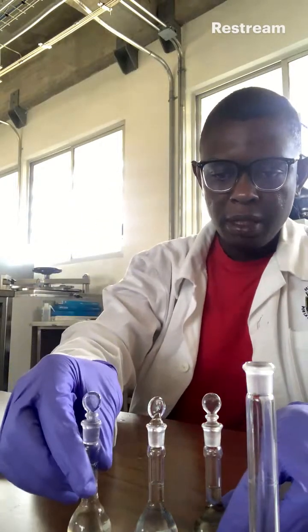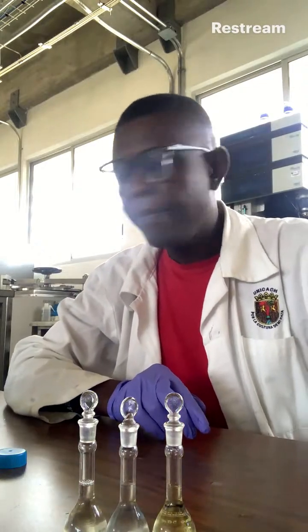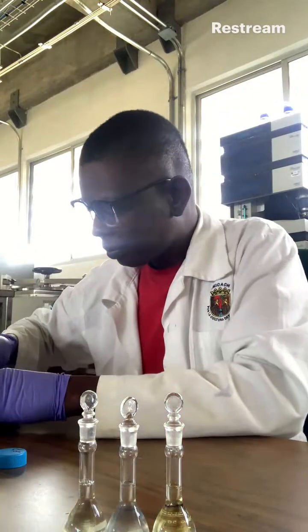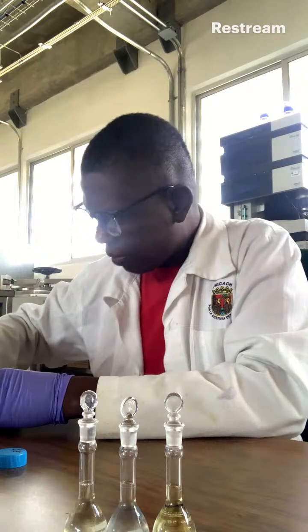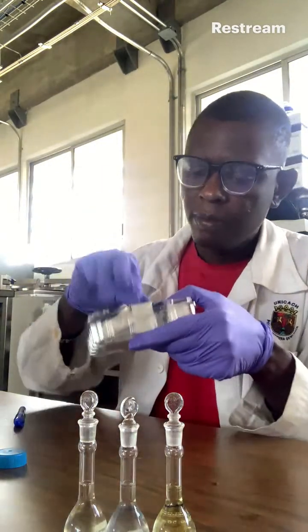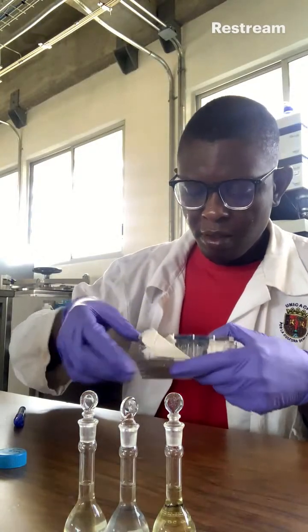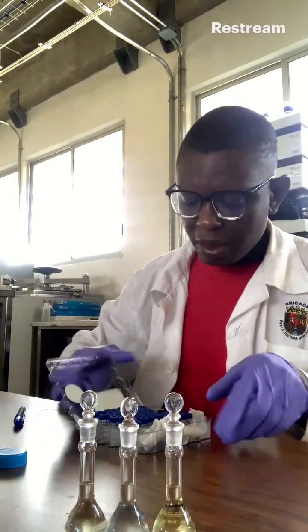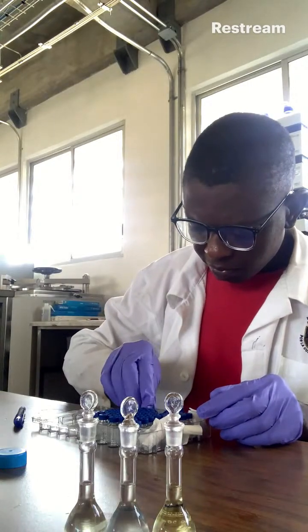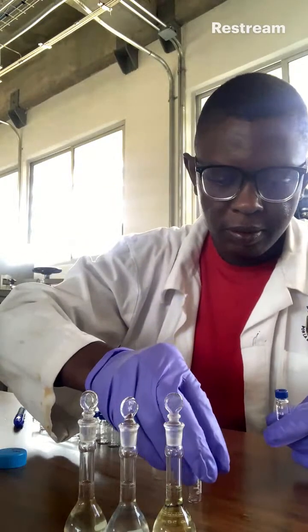All right, so I've gotten my 3 samples. Remember, I am working with the GC machine. So for the GC machine, I'll have to transfer some of them into these bottles.